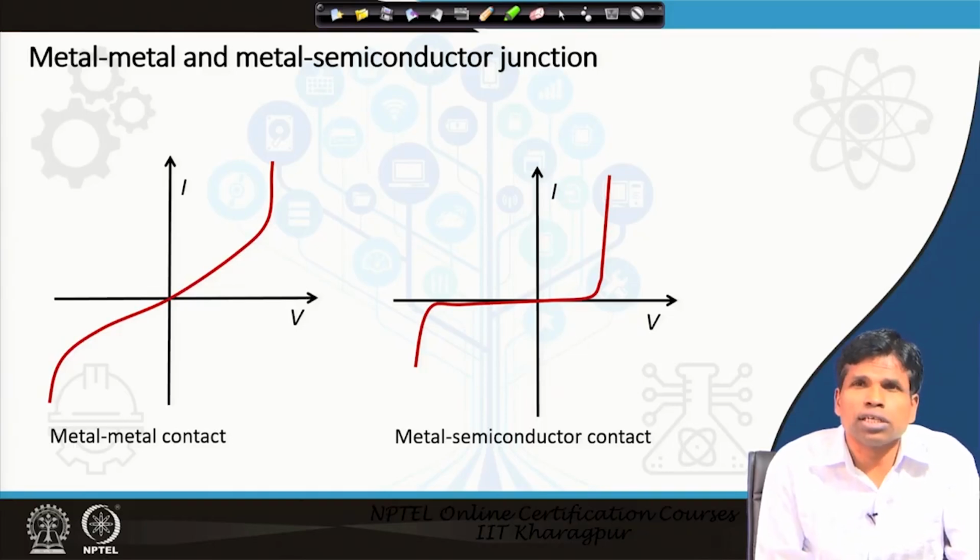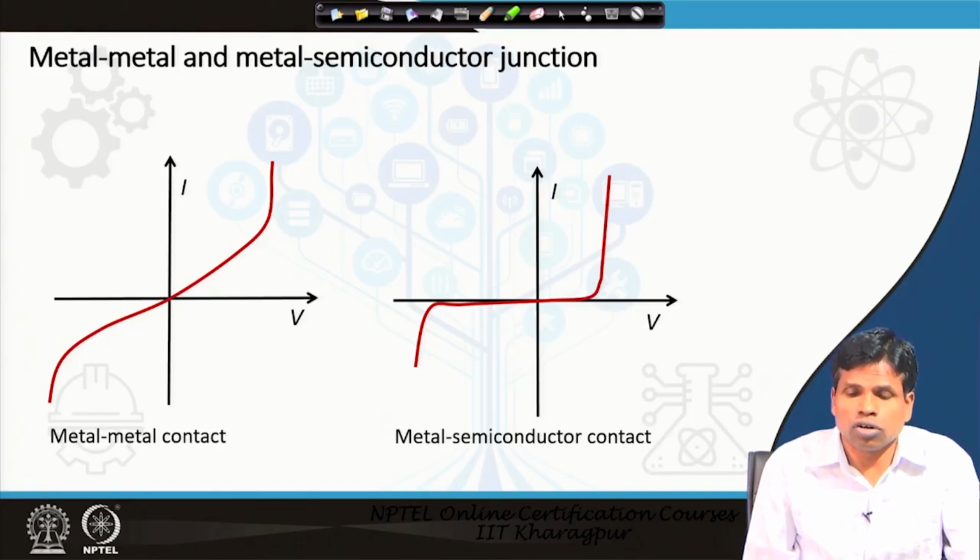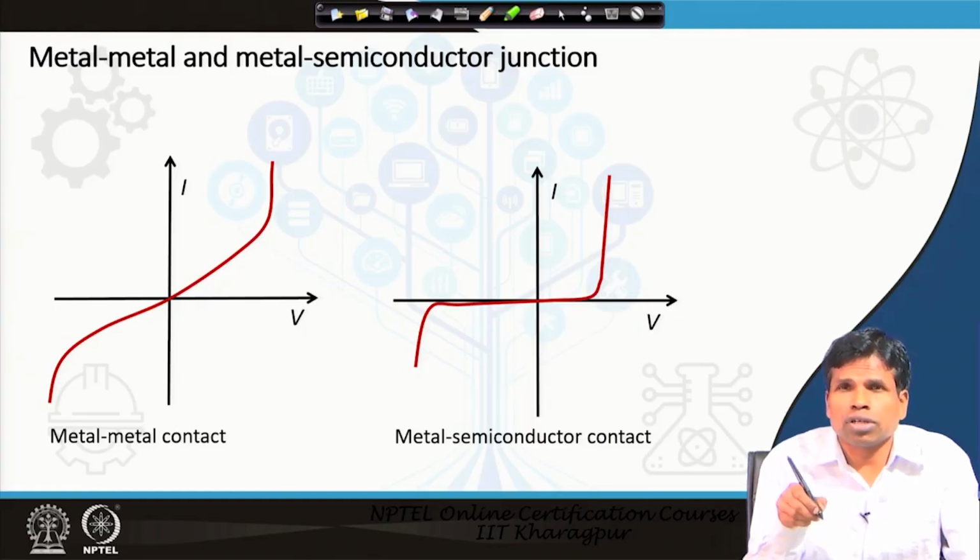Then you can see the ohmic behavior in the IV graph. Similarly, for a metal-semiconductor contact, you can see how the IV graph looks; all these kinds of measurements can be done with this. But the importance is that this type of measurement is also very conventionally done in research, but here the measurement is done through a single atom.